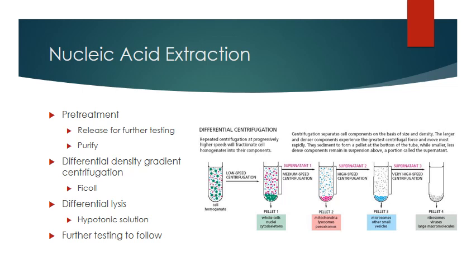So if we use our example of a white blood cell, because that is really one of the easiest cells to get at, it's just a little bit of phlebotomy and we get at it. So let's separate out the white cells out of the peripheral blood or the bone marrow, whichever you're using, by using differential density or gradient centrifugation or differential lysis.